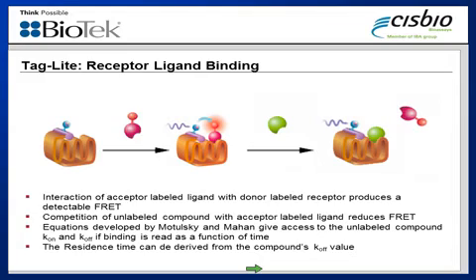The second mechanism of action project was performed to study the correlation of ligand binding to the CXCR4 chemokine receptor, as well as interruption of that binding, and then how it relates to the final invasive phenotypic effect. The expression of CXCR4 is tightly correlated with the metastatic properties of breast cancer cells, and in vivo, neutralizing the interaction of CXCR4 with its known ligand, SDF1 alpha, also known as CXCL12, significantly impaired the metastasis of breast cancer cells and cell migration.